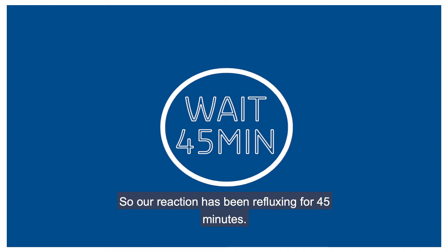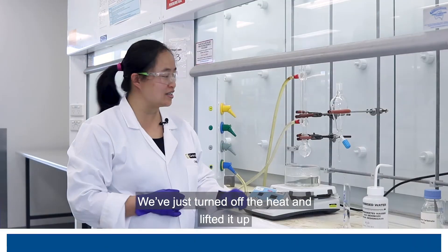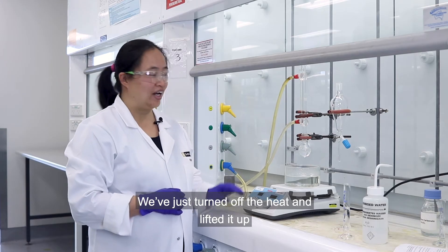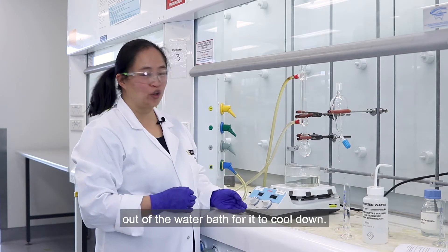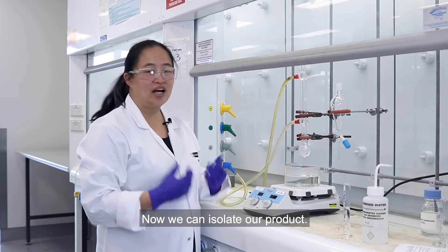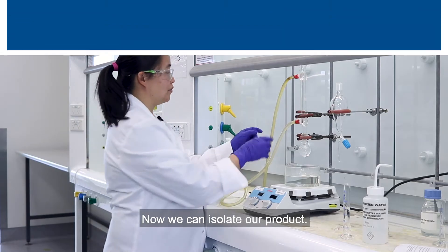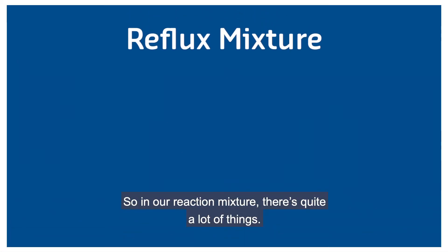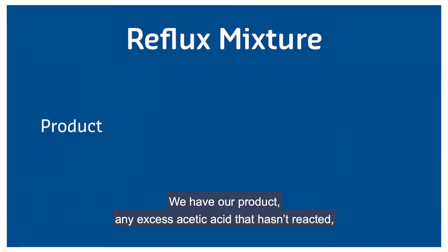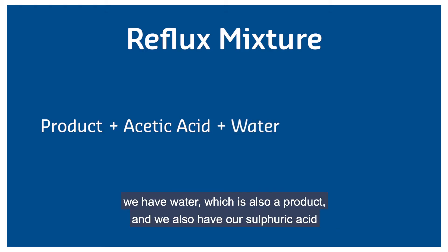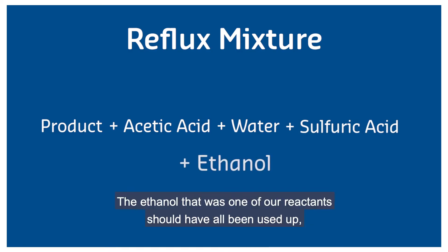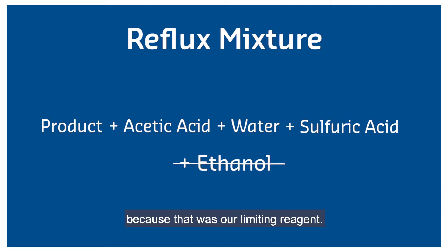So our reaction has been refluxing for 45 minutes. We've just turned off the heat and lifted it up out of the water bath for it to cool down. Now we can isolate our product. In our reaction mixture there's quite a lot of things: we have our product, any excess acetic acid that hasn't reacted, water which is also a product, and our sulfuric acid catalyst. The ethanol, which was one of our reactants, should have all been used up because that was our limiting reagent.